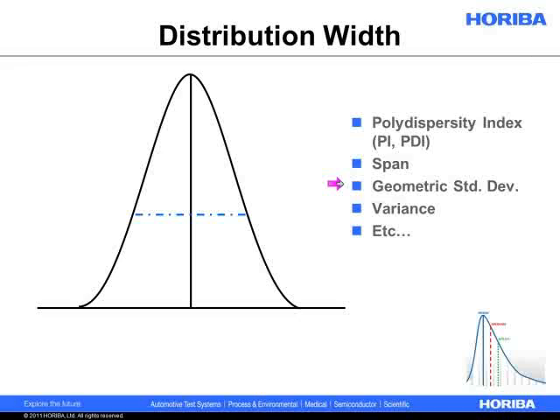I talked about geometric standard deviation. I know of a few users who also use variance. And then there's actually some homebrew calculations as well, which is why in the LA950 software we added the ability to create custom calculations.